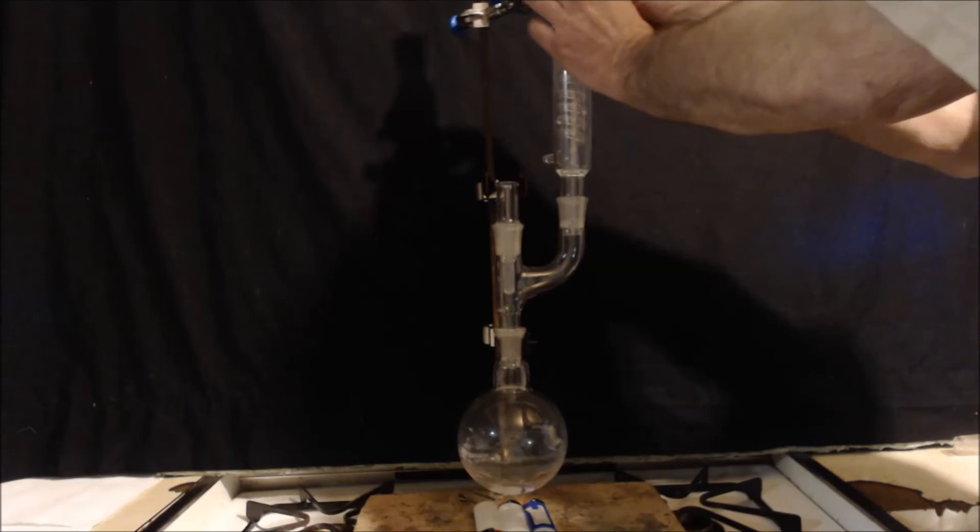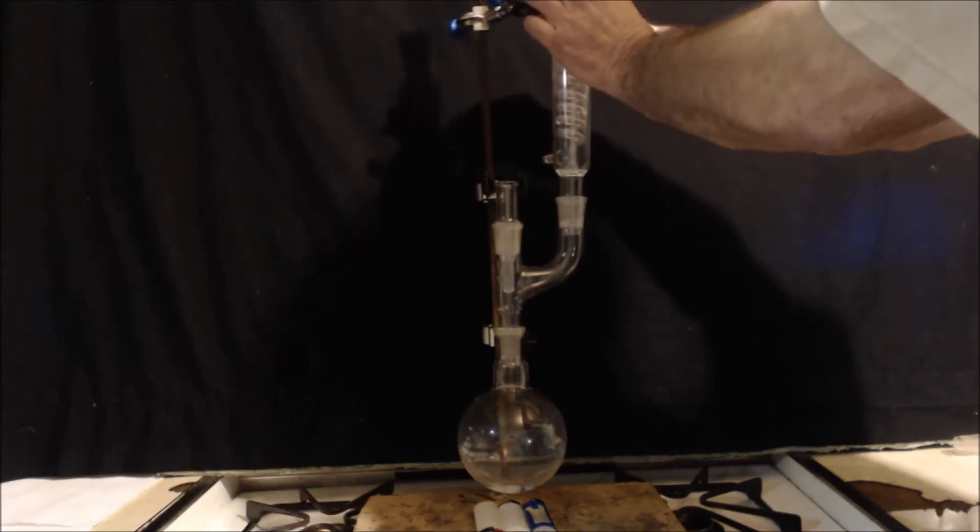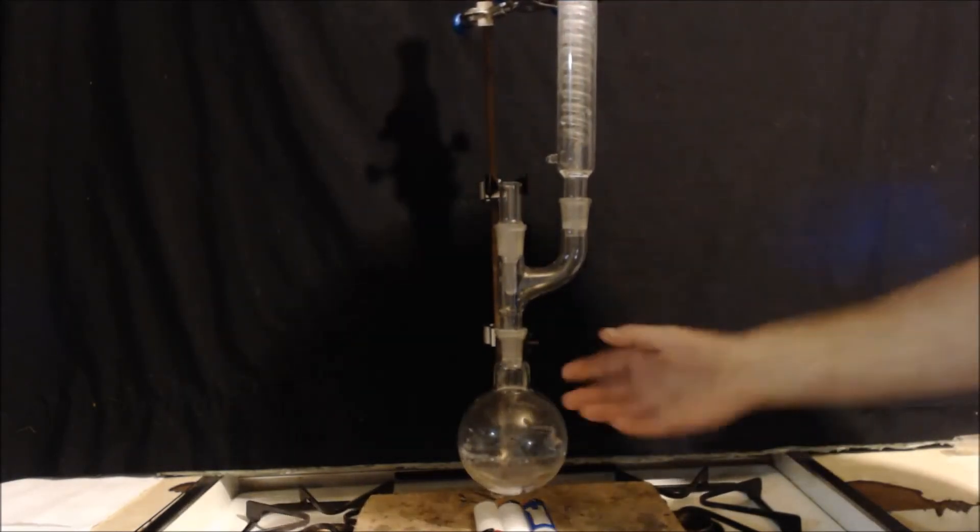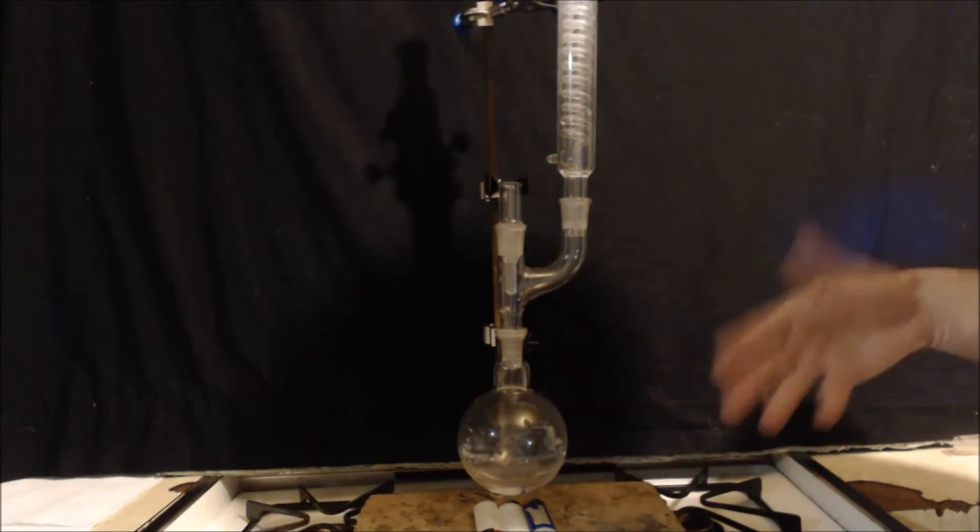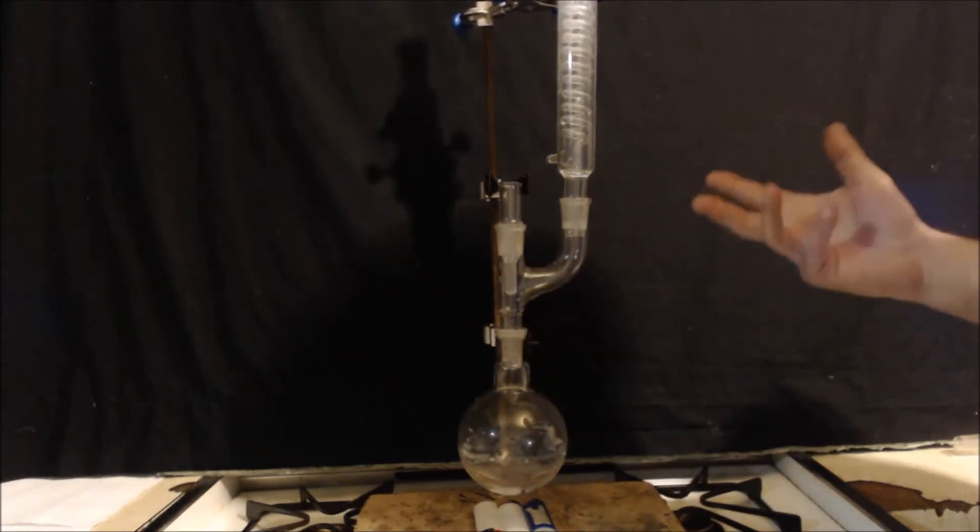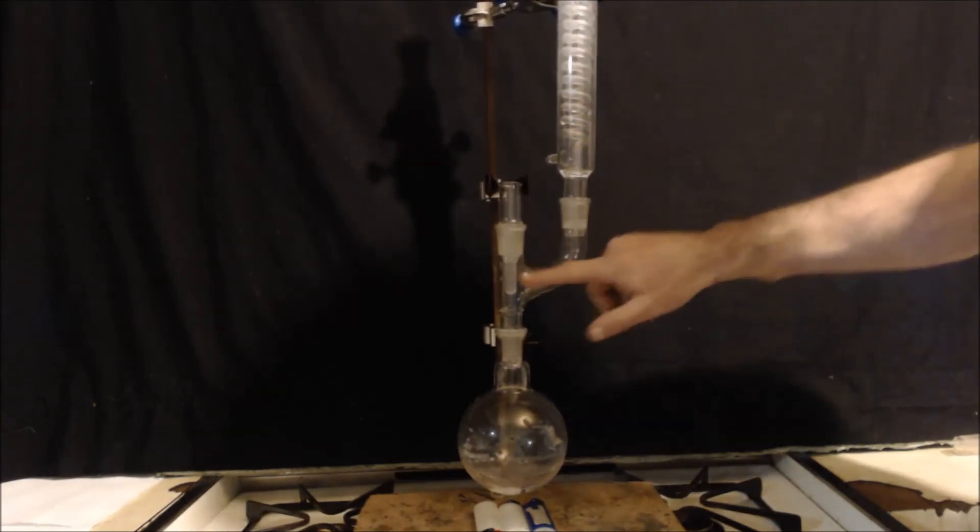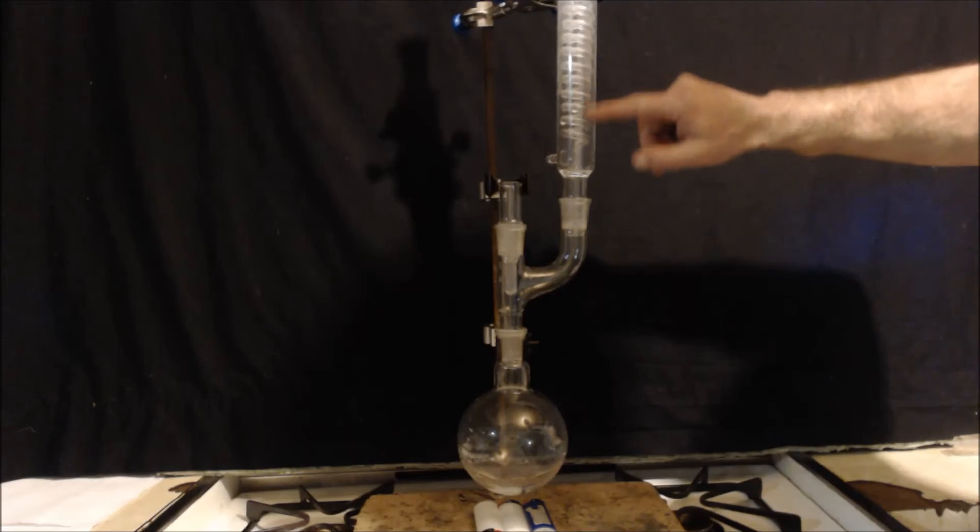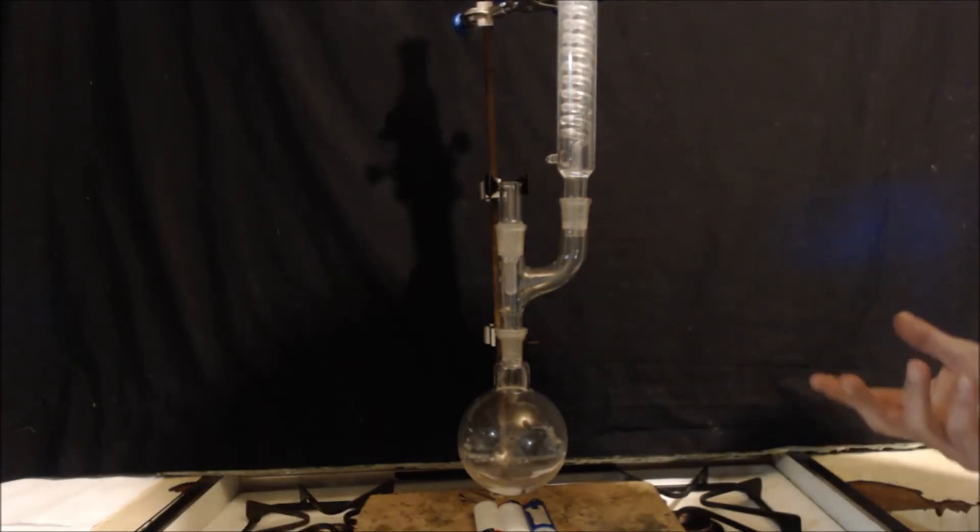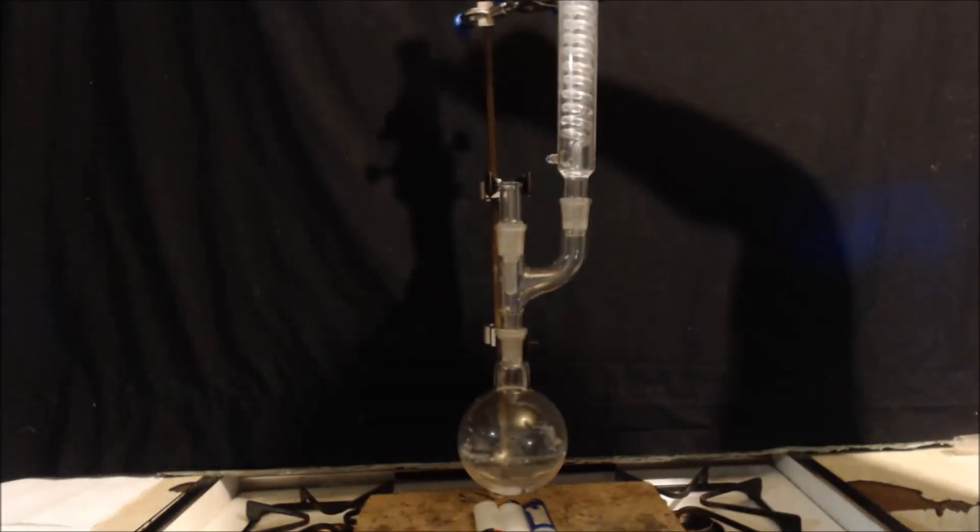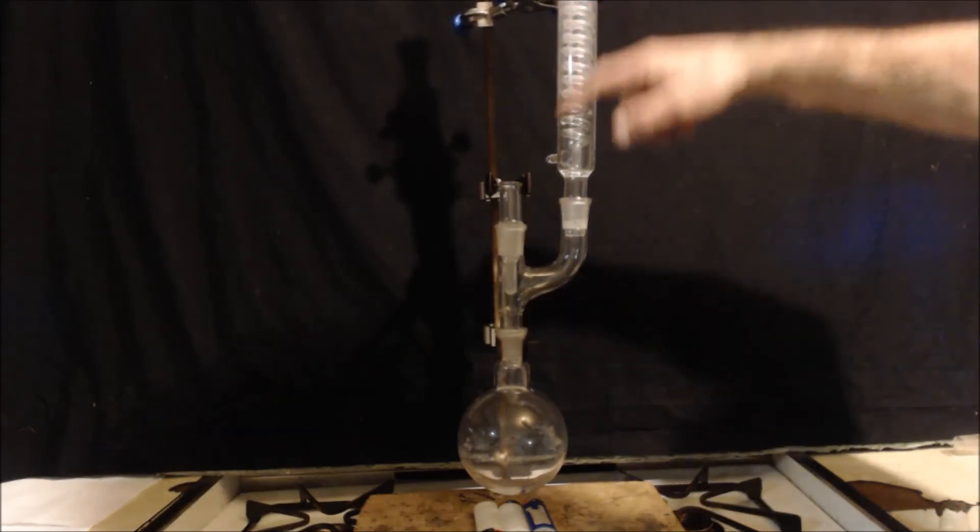And another thing is this setup here where you're refluxing, this can actually be set up in conjunction with the distillation. So you can distill something and also reflux it at the same time. Like let's say I had ammonia water in here and I just wanted the ammonia out. I could heat this up and what would happen is the ammonia comes out but also the water comes out. But if I put this condenser here, the water comes up, the ammonia comes up, but the water would be condensed by this cold condenser. But you're not going to condense ammonia, you'd have to have it freezing, I mean, you need some dry ice. So the ammonia will come out off the top, you can distill the ammonia out and reflux the water back in.